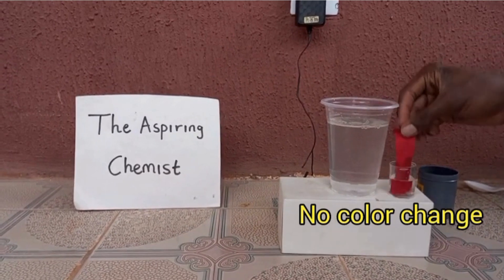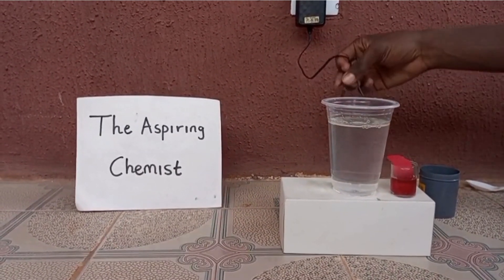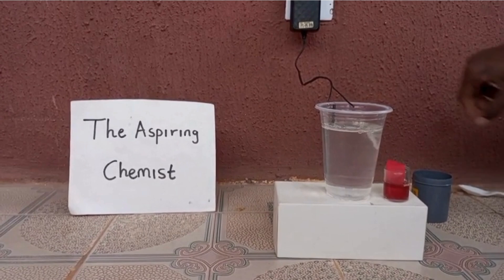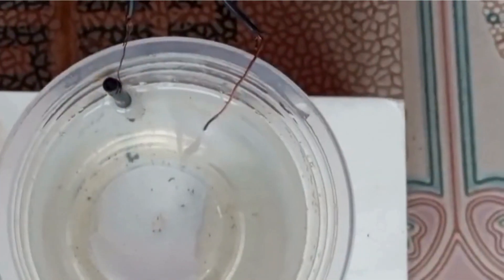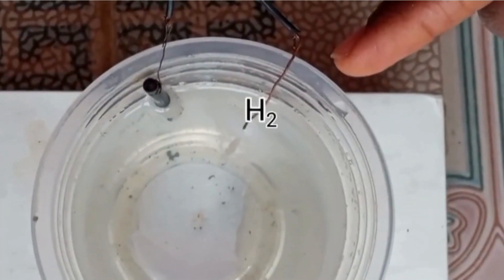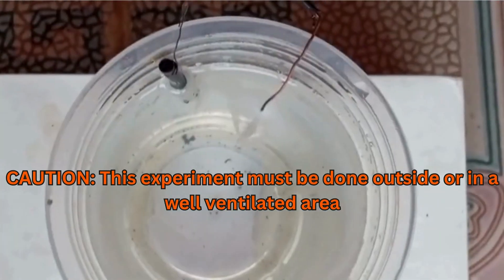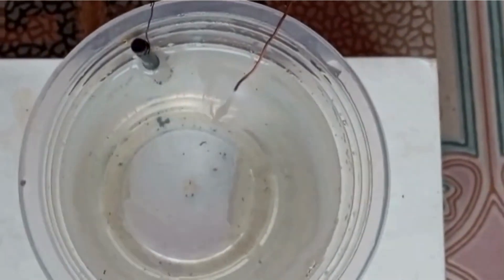So the next thing we'll do now is to attach the electrodes and turn on our switch. Now let's see what's happening on the electrodes. As you can see, hydrogen gas is released at the copper cathode while chlorine gas is released at the graphite anode. That's the more reason why this experiment should be done outside. I'm going to leave it for a day and come back tomorrow to check for any changes.